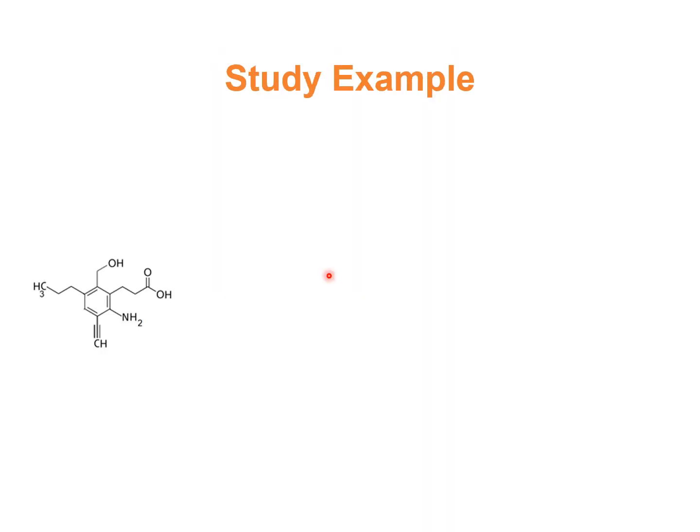So let's get into it. We can learn interpreting IR spectra in two ways. Either we can look at the spectra and try to deduce from where peaks have appeared, or we can take some structure, observe the functional groups, learn where they appear and try to locate their peak positions and shapes. So this is the hypothetical molecule which I have drawn because it contains the majority of the functional groups which we are going to learn at the basic level.